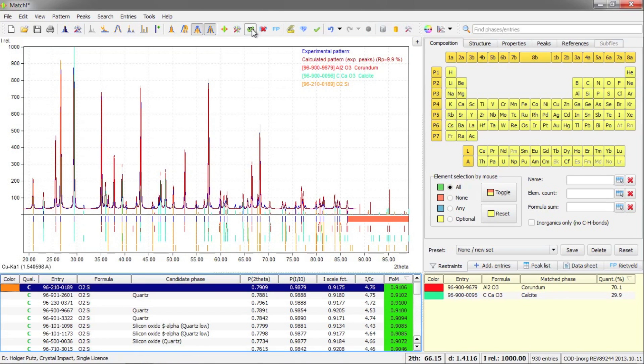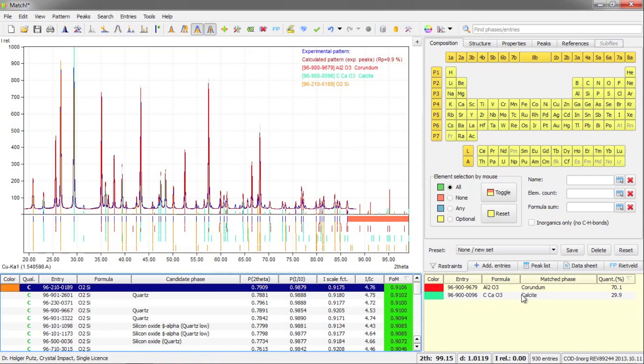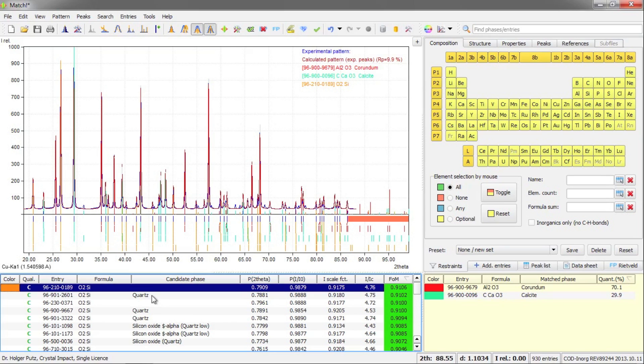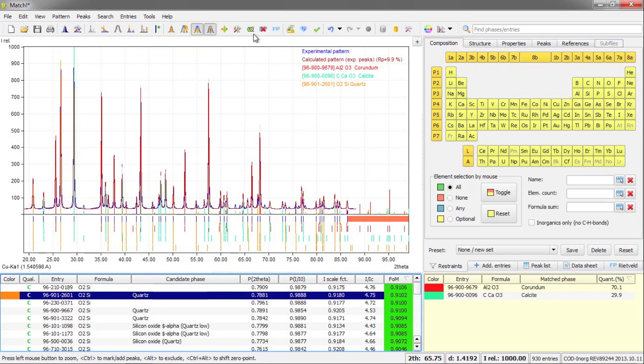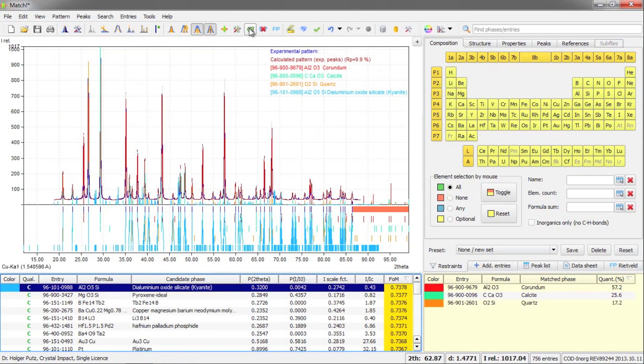This phase is transferred to the match list here on the right hand side. And the next best matching phase is presented here. Now I don't want to use this first entry because I would like to have the candidate phase name quartz in here. So I click on the second line instead and press the select phase button.